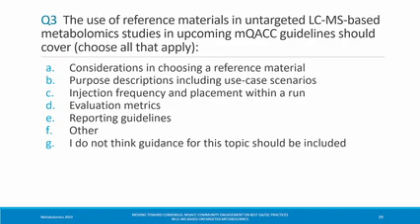No question. Cost is probably the reason most people don't use it. And yet they're forgetting that the majority of the cost in any experiment is the time involved in working up the data. The criticality of having this material in there is to exactly save the 14,000 injections so that you don't have to do them twice. They're irreplaceable samples. So cost is a terrible problem, but it's also a critical answer. And I just couldn't let that go by.